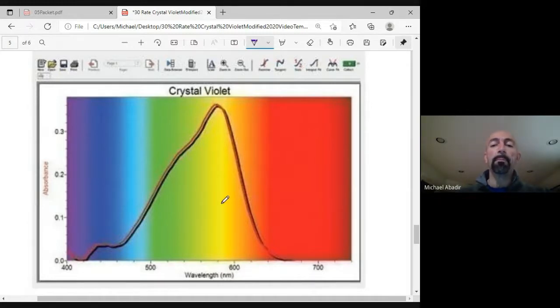That's the optimal wavelength that it will absorb. It will not absorb this purple, and it will not absorb blue very well, and it would not absorb red, which is really interesting because when you see something that looks purple, it's reflecting purple to you, but absorbing all the other colors. So it's absorbing all the other colors and reflecting purple to you.